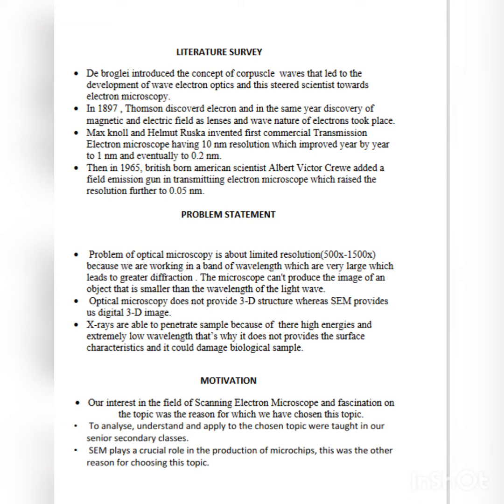Another, the three-dimensional capacity of SEM is valuable to microchip design and production and to increase accuracy in criminal and forensic investigation like jewelry examination, handwriting, and fingerprint analysis. Fourth, the medical science field, like understanding the morphology of viruses and bacteria. Fifth, it is also used in soil quality and toxicity measurement for farming.